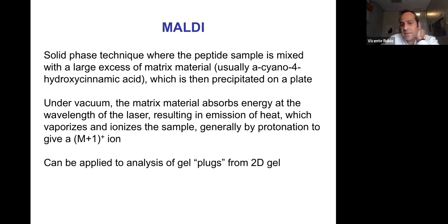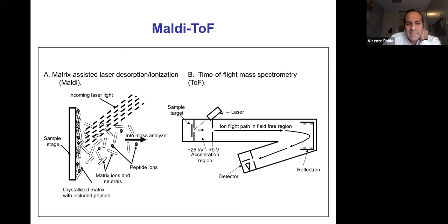And that can be used right away from protein samples from 2D gels. And this would be the picture of what I was explaining.